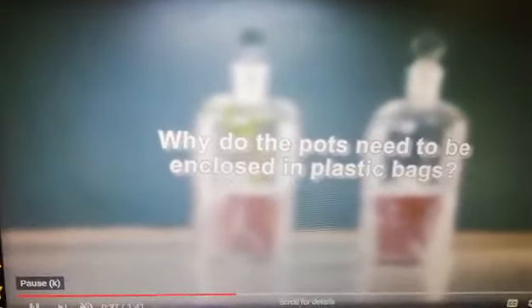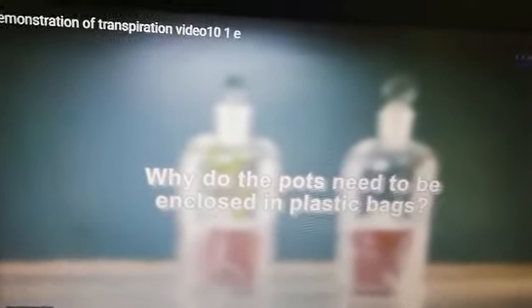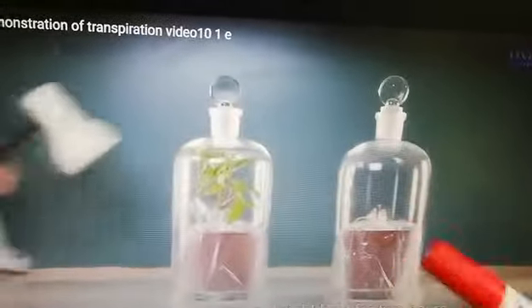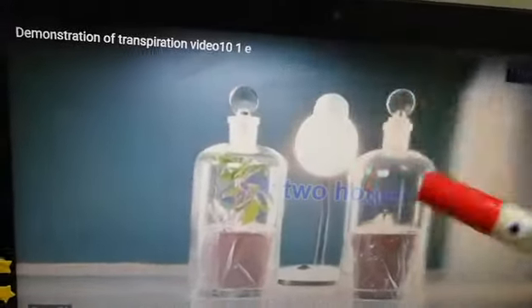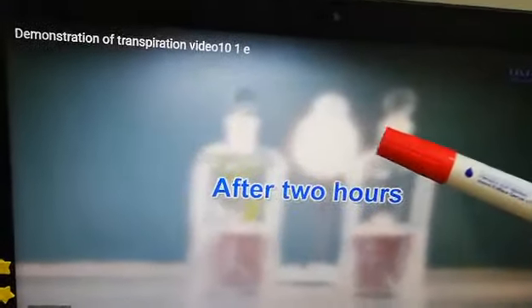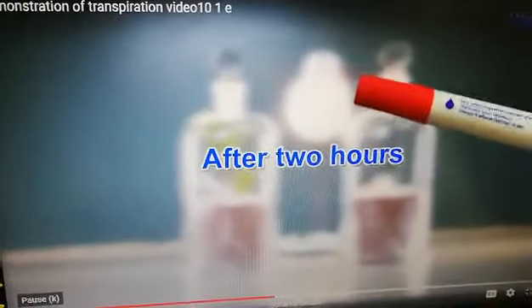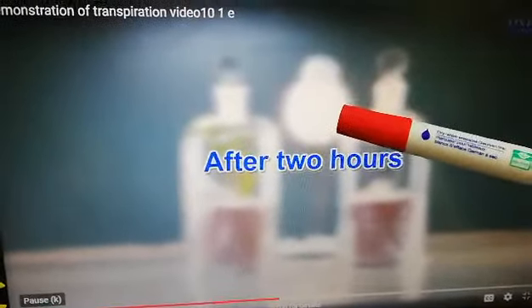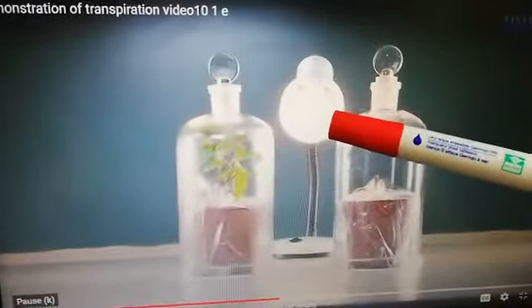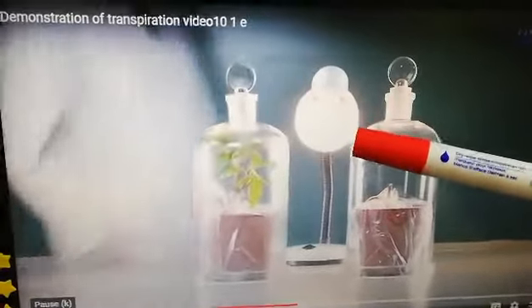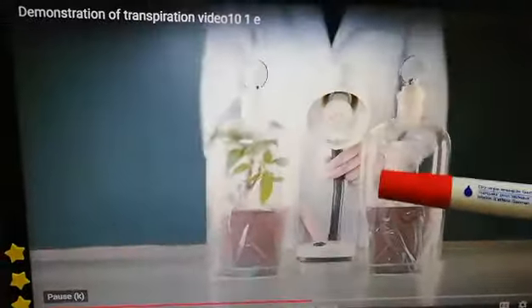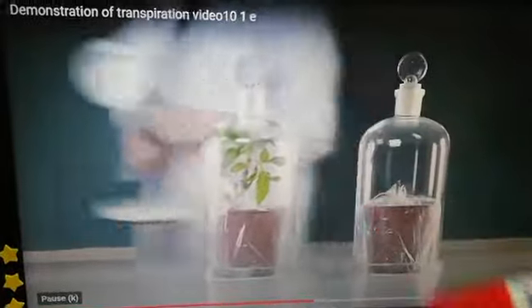So why do we need to enclose the plants within the plastic jars? Now what we will do — we will have this setup with an electric lamp. We will glow it for just two hours between these two parts.